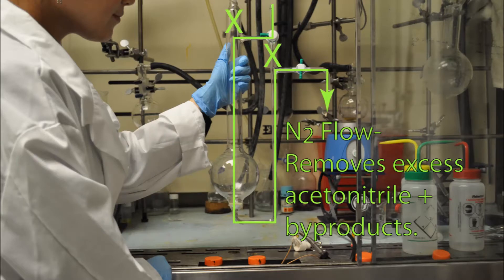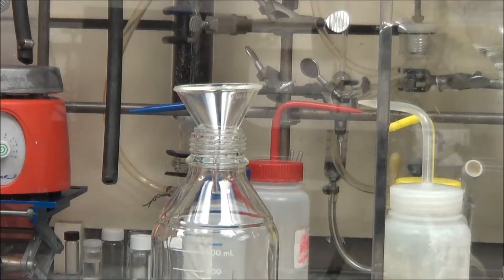the flow is altered with these valves such that the acetonitrile with impurities is then pushed out the right-hand side of the stem and out into a container.